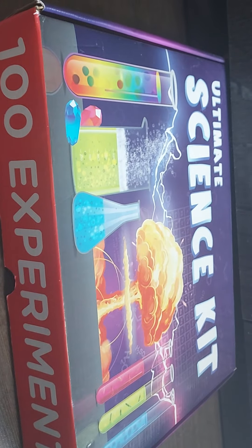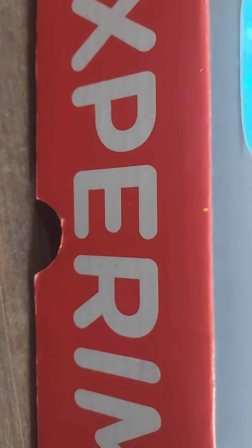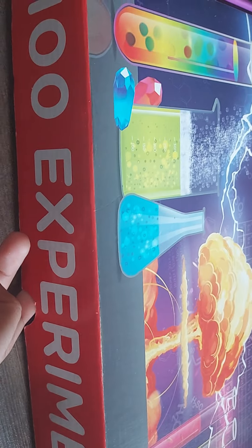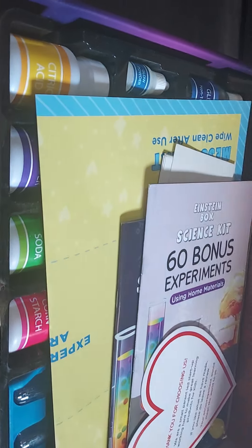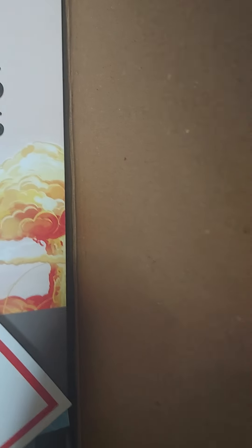Here is the box — there's a hole like this and it will open. Here is the tape which I'm going to cut, and now I'm going to open it. Okay, so I have opened this box.